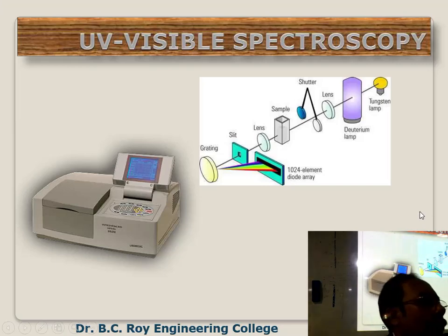UV visible spectroscopy. This machine I have at the top floor, maybe you have seen. So, what is the purpose? First of all, I will tell you what is the purpose of spectroscopic techniques.